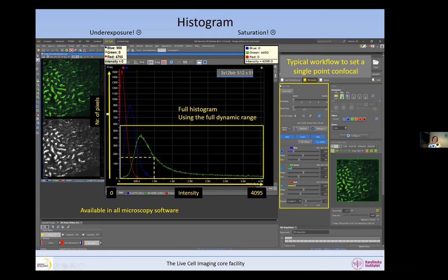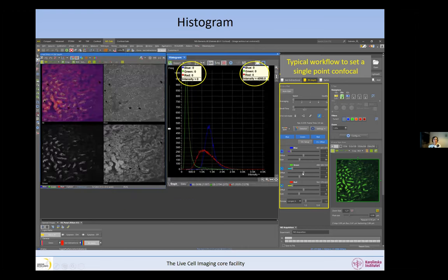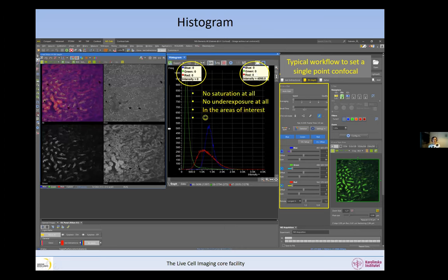We will talk later about how to avoid saturation and underexposure in the typical workflow for setting a single-point confocal. When an image is acquired properly and correctly exposed, we have zero pixels underexposed and zero pixels saturated. That is when we are happy — no saturation at all.